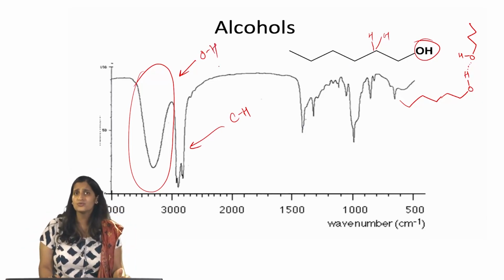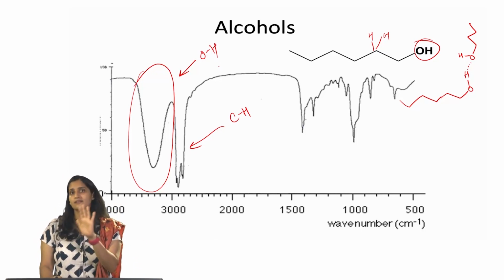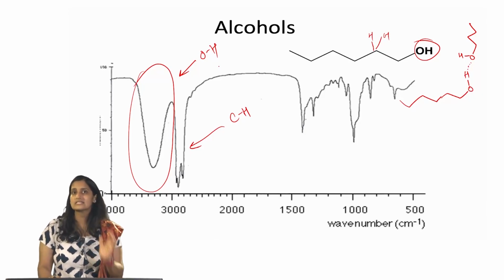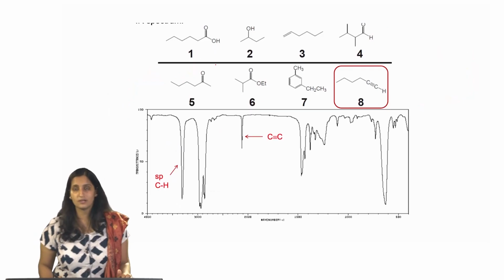And for reference, you can refer to the IR table of various functional groups, or rather various bonds, and their corresponding stretching frequencies that are given. We have given it as supplementary material. You can refer to that. I am going to try solving this particular question here.